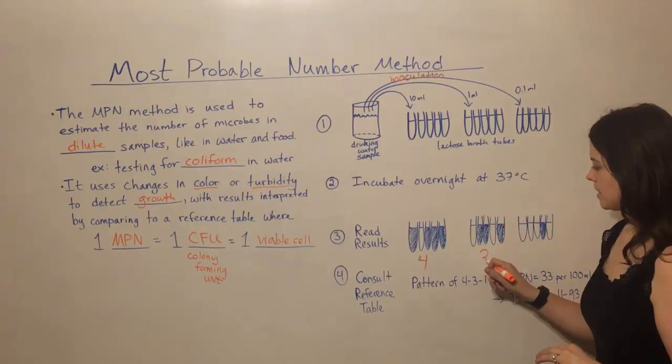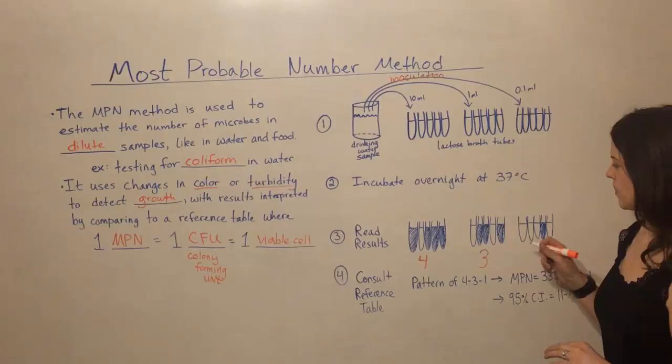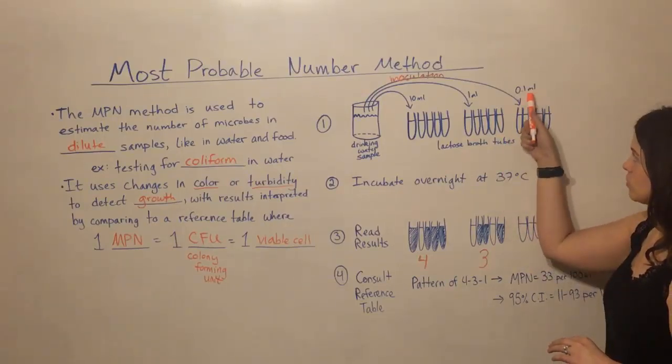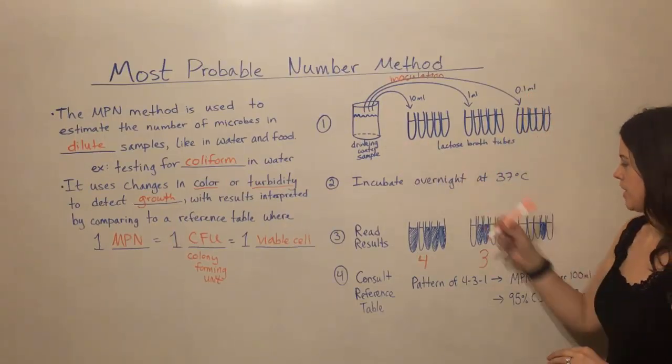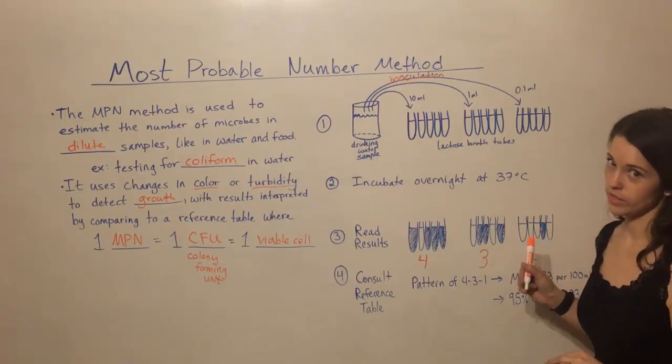We have three positive tubes here. Three showed a color change. Two did not. And then where we were adding the smallest amount of the water sample, we just got one positive tube. So one changed color and four did not.